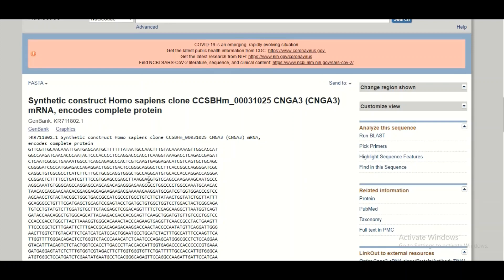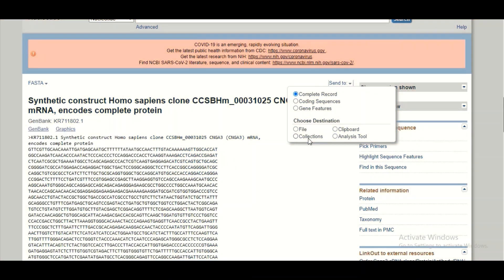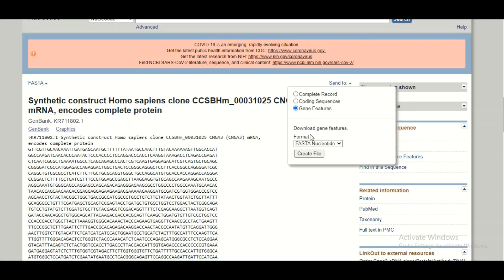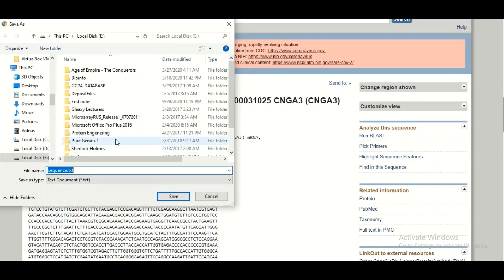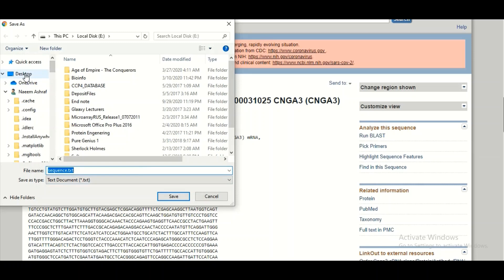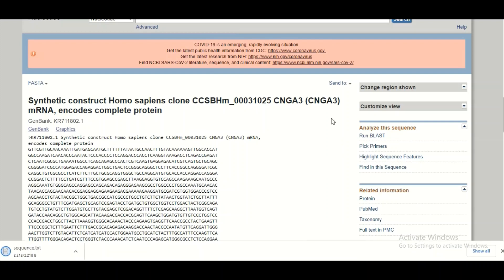To download the FASTA format sequence to your machine, click the 'Send to' button, then select 'Gene features' from the drop-down menu, choose 'FASTA nucleotide,' and click 'Create file.' After a few moments, the sequence will be downloaded to your system in notepad format, and you can save it wherever you want — for example, on the desktop.